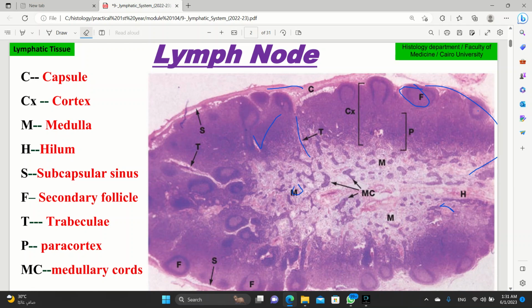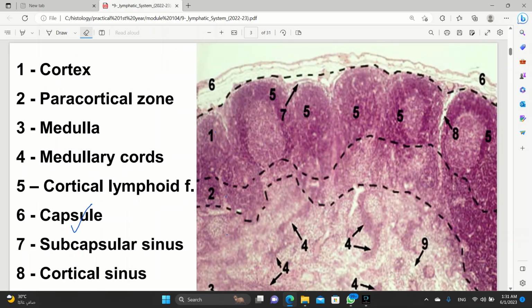Here's that. What's that color? Let me erase that. Oh, that's some sort of pinkish. So that's a trabeculae. Oh, that's a trabecular sinus or cortical sinus. It's the same thing, by the way, but I prefer trabecular sinus. Okay, that's the trabecular sinus. I'm not highlighting anything, dude. Yeah, now we're highlighting. That part is a trabecular sinus. I like saying that it is white. That's not scientific, but this is how I memorize it.